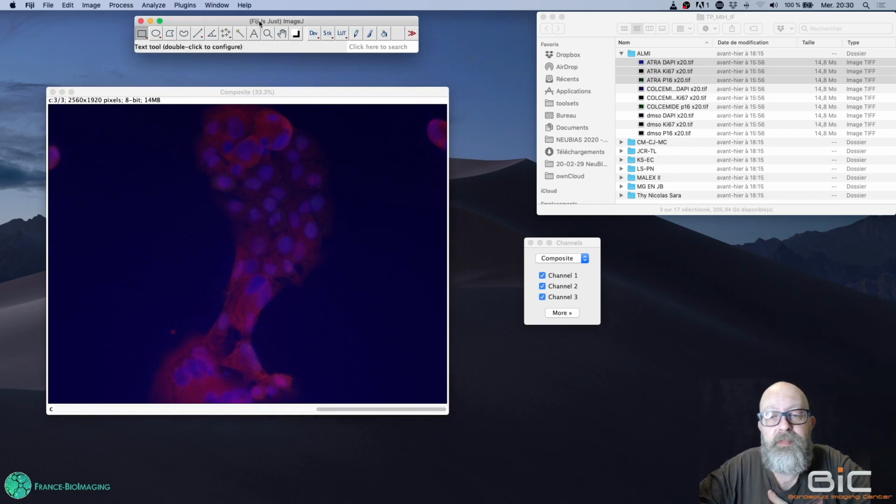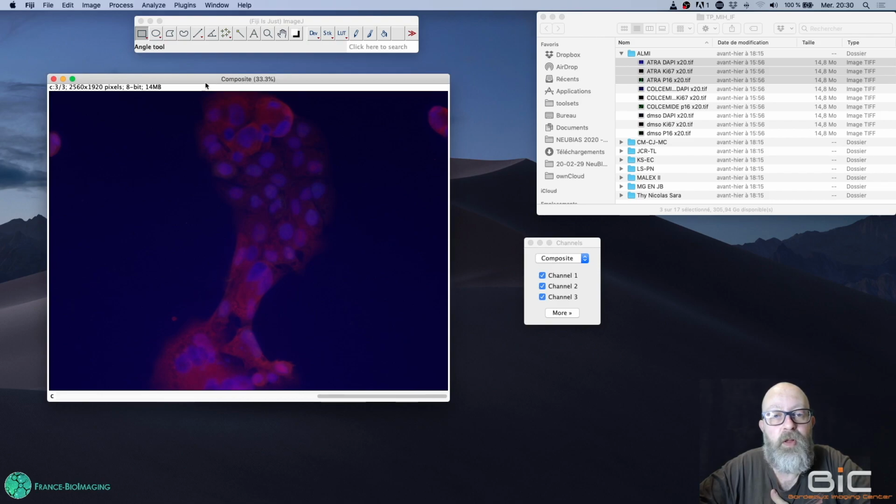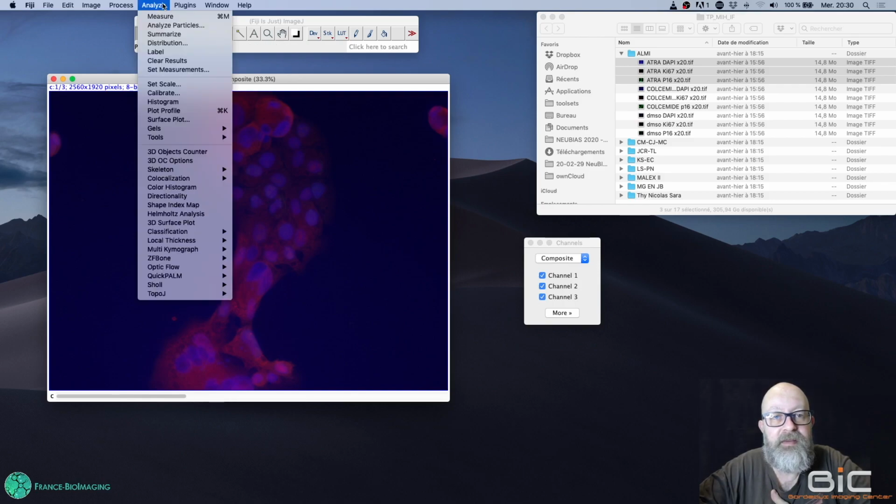A histogram, so you can manipulate the histogram, and in this case it will be already a processing. But a histogram is also a first analysis over your image. You're analyzing the content of your image. So it's quite normal to find the function in Analyze, Histogram.